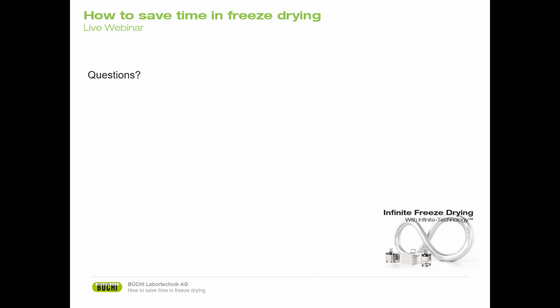Okay, good. Then I have another question for Moritz. Instead of taking the pressure difference, why not just take the Pirani gauge progression as an indicator and determine the endpoint by looking at when it stabilizes again after it drops because of the change in gas composition?